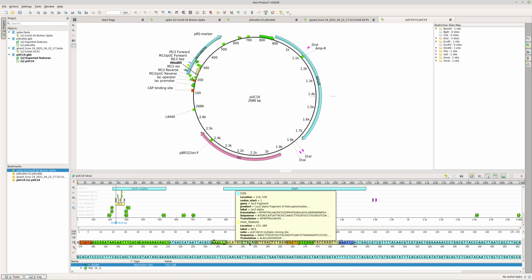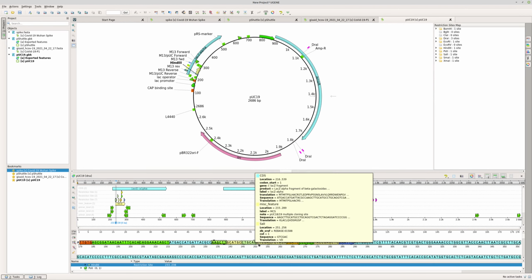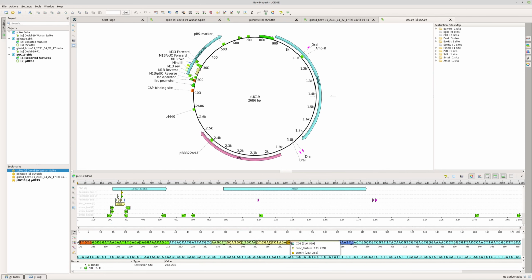just the CDS. This one over here is telling us it's PstI and SalI, followed by BamHI, followed by SmaI, XmaI, right? Followed by over here EcoRI. So in order, we can see EcoRI is the last one, and probably the first one is going to be HindIII, right? So HindIII to EcoRI in this directionality that we see there. So that's the first thing we need to understand about this map, right?